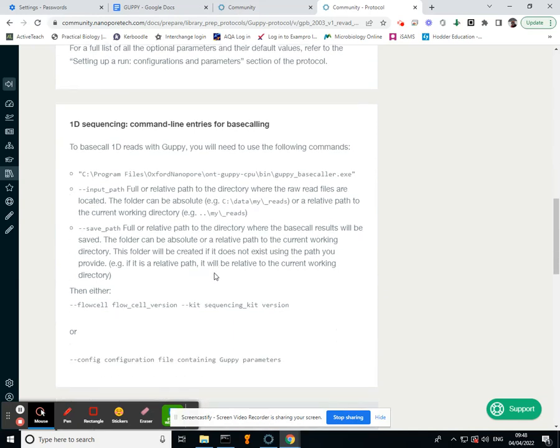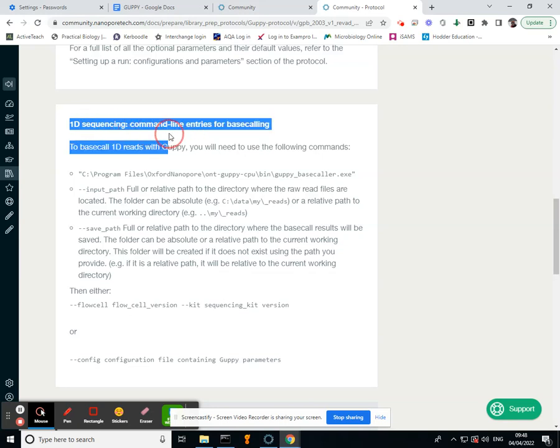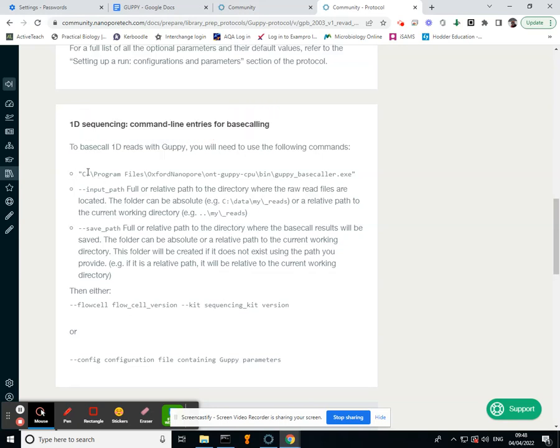Now this is what we want—this one-dimensional sequencing. It's really nice because you can just kind of copy and paste this. The speech marks are important.